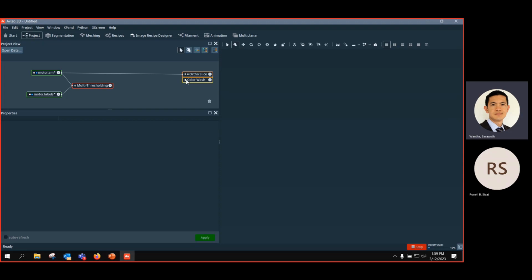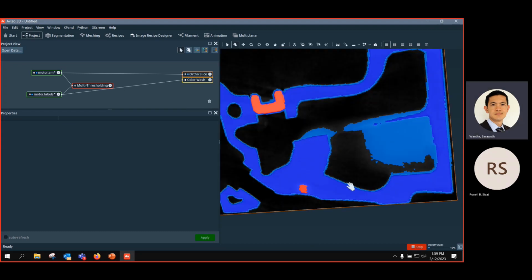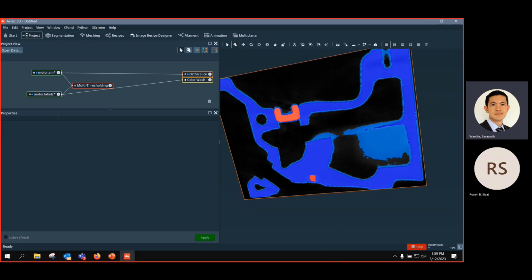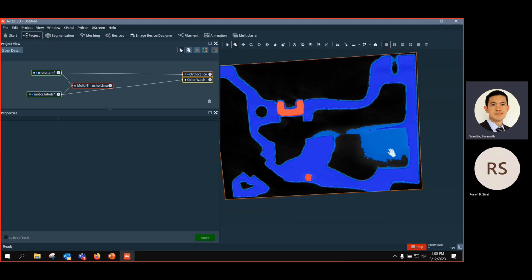So yeah, the idea next is that now we create multi materials in one label field. So so far we understand that we have grayscale and we create a so-called label image. And then here we have a multi-material label image, and this multi-material label image, we call it label field. So in this label field, we have the field like a container, and this label field contains at least 3 materials: light blue, darker blue, and the red one. Each material has the ID 1, 2, 3, and 0 is background. So now I want to extract the individual ID of these objects.